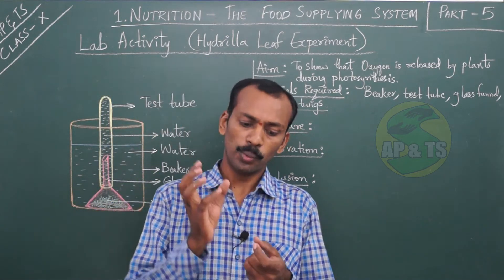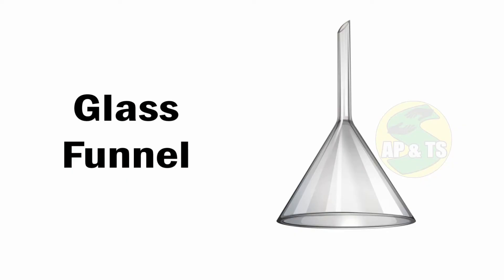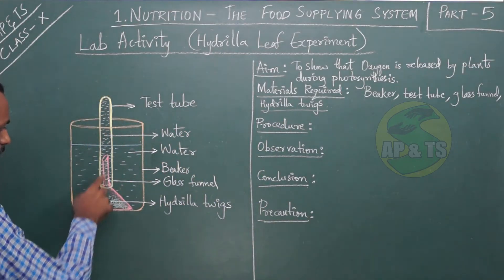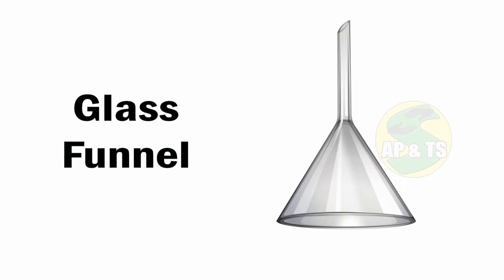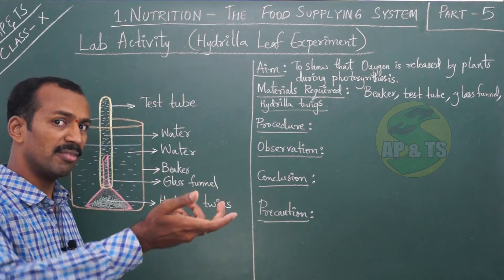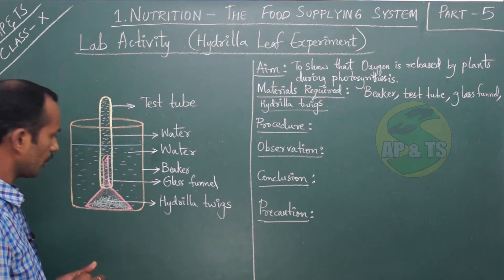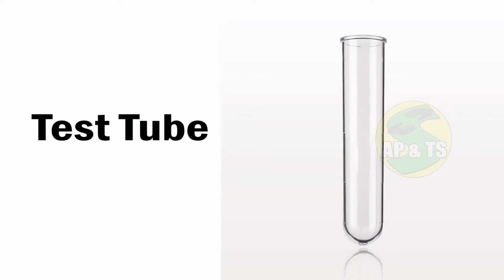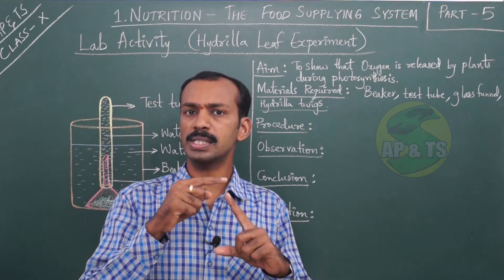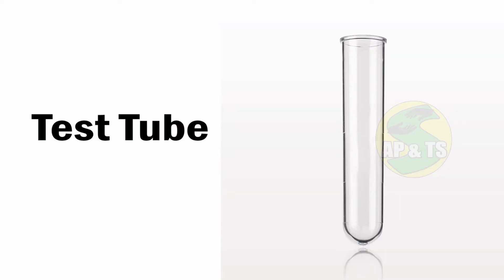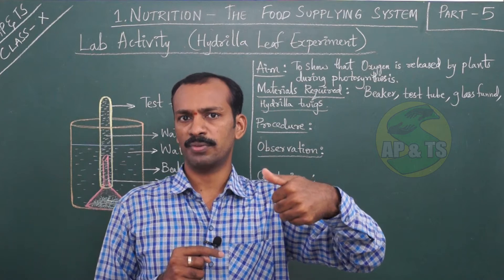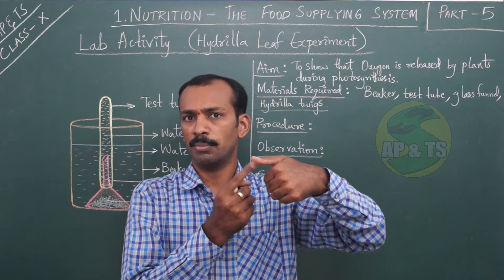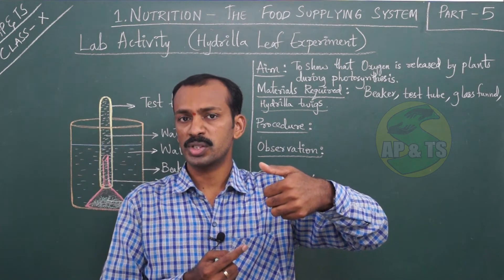After placing the hydrilla twigs in the beaker, place a funnel over them in an inverted position. The funnel is cone-shaped with a long cylindrical tube on one side. Now take a test tube and fill it completely with water — there should be no gap. Fill it up to the brim, meaning up to the tip of the test tube. Then use your thumb to close the mouth of the test tube so there is no chance of water escaping.